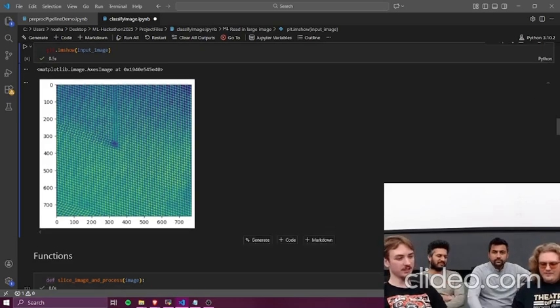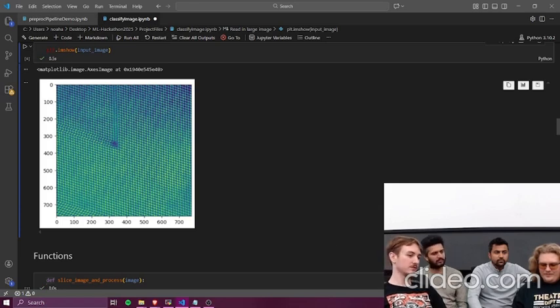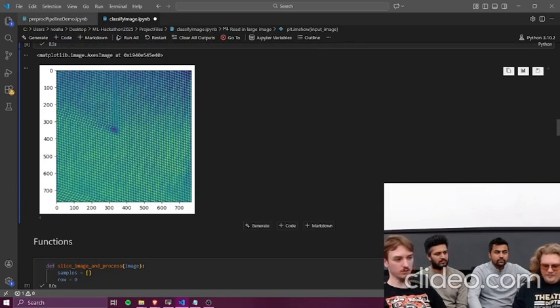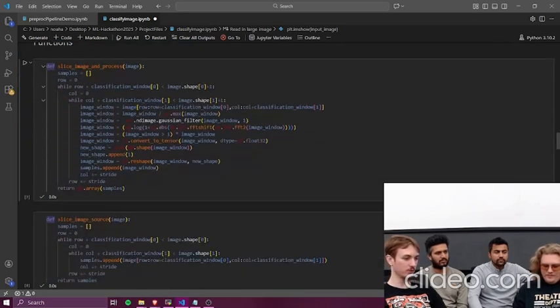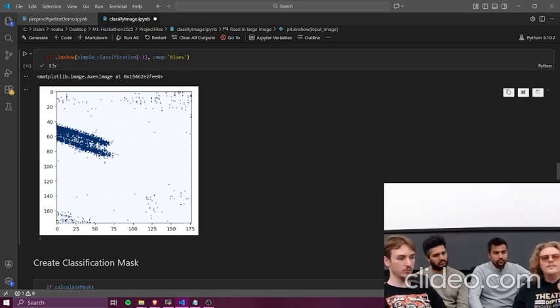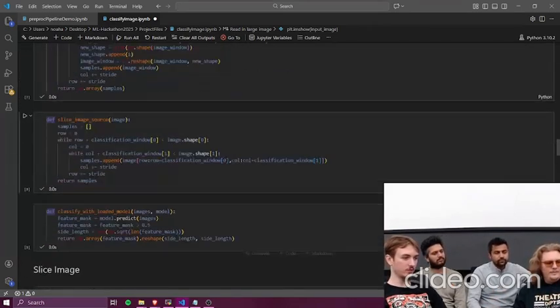Our approach accurately labels defects in STEM images using an ensemble method of convolutional neural networks. So here we have an example STEM image, and here we're just going to label one particular type of defect at the moment, a stacking fault. So here is the raw output of our system, and you can see it very accurately labels the region in which the stacking fault is present.